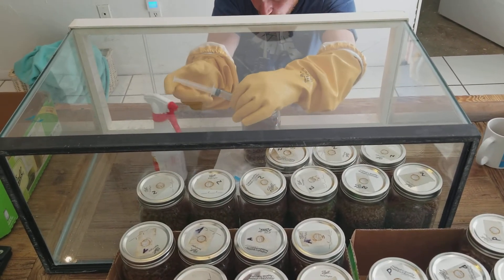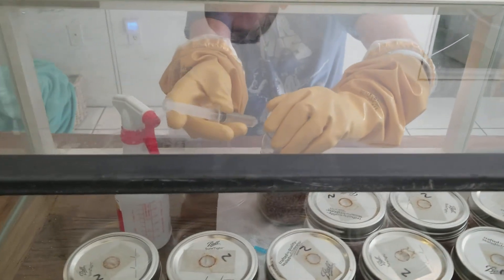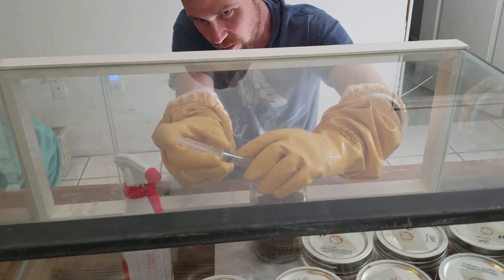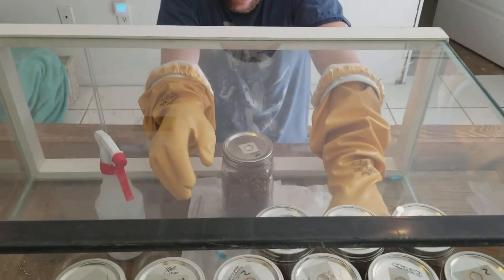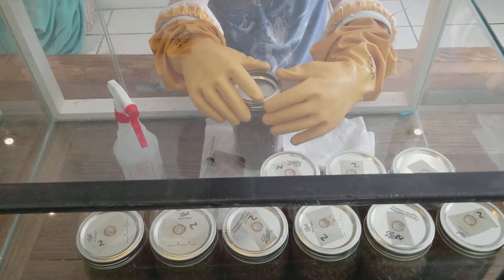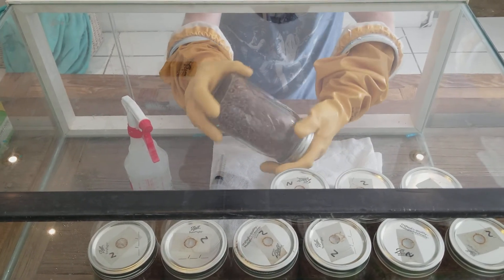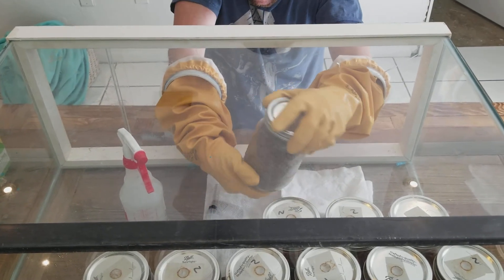What I'm going to do is put about one cc in there. I'm going to open the lid carefully — just pop it up and put one cc in. Then I put the band back on and turn the jar around to evenly distribute the liquid culture throughout the grain.